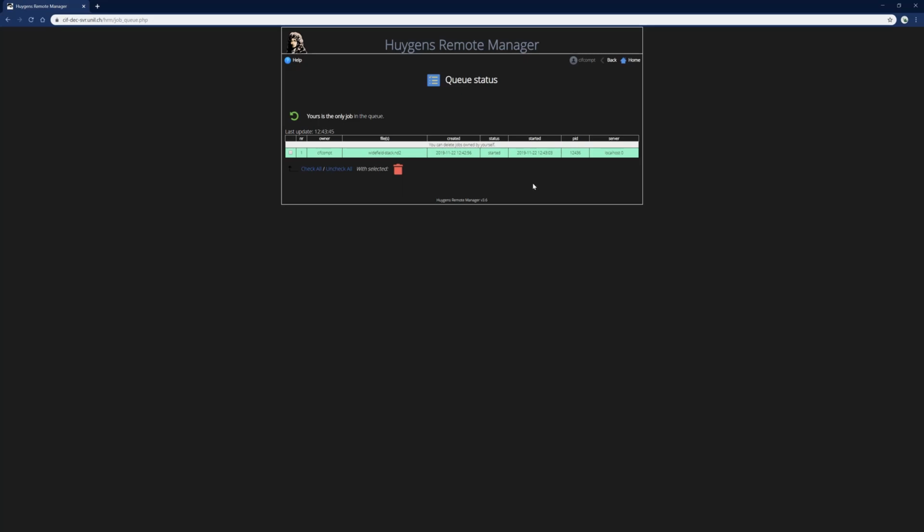So in the case of multiple users using the system at the same time, the queue will try to prioritize having multiple users getting results, not having the first user having all his files processed first, and then you will get to the next slot.